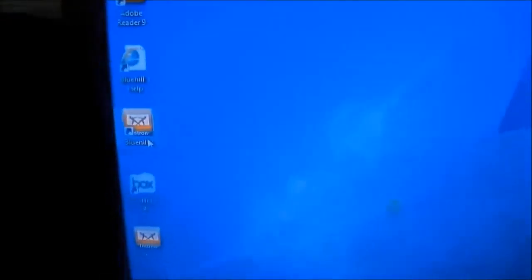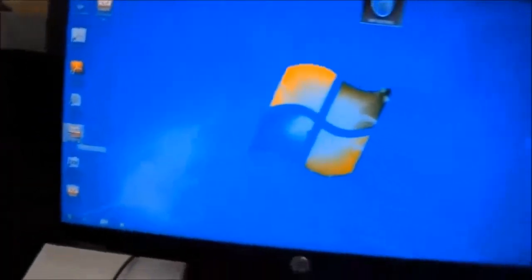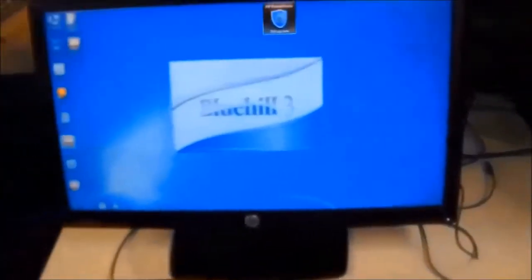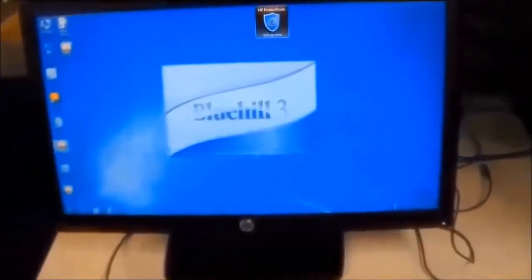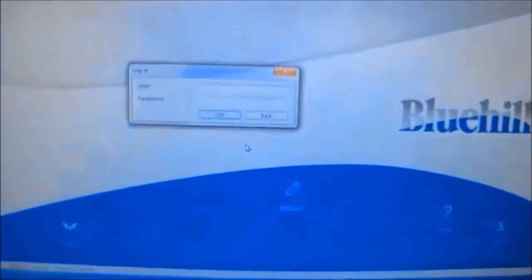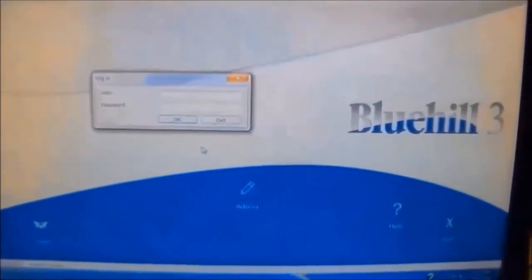On the software, which is called Bluehill, click on it to open it. The software is turning on. When the software asks for a password, just enter the password.